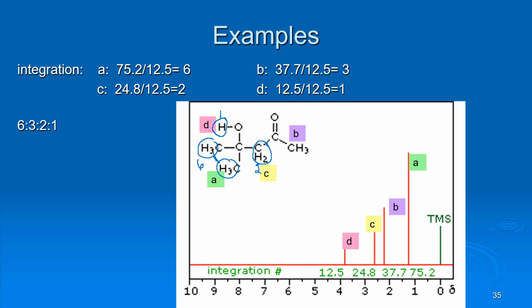And it's going to be similar to these because it's attached to carbons. It might be slightly further left because it's attached directly to the C double bond O, although these are attached to the C, attached to the O. So, but I'd say this one being between both of these carbons might be a little further left. But when we look at it, we'll see that it'll make sense.